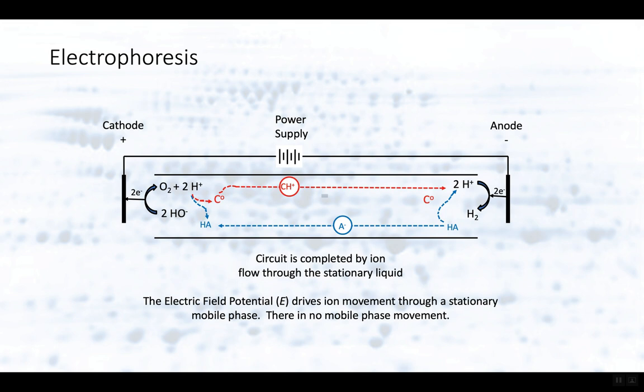Any molecule they're able to oxidize and reduce can provide electrons at the cathode and take up electrons at the anode. Water is a very good one. If we try to use a different solvent system, we have to make sure that the solvent system is capable of donating and accepting protons, but we can use other systems to make this work.